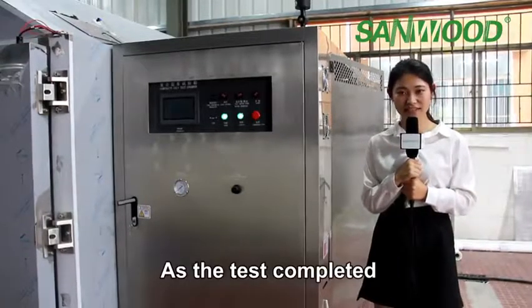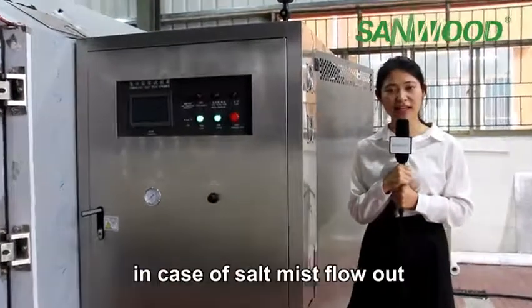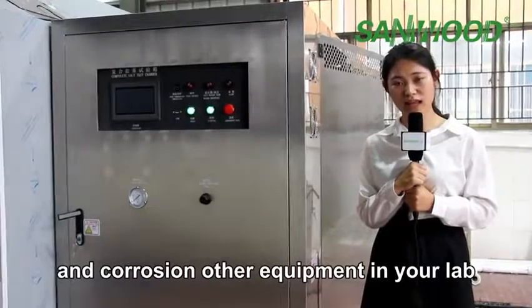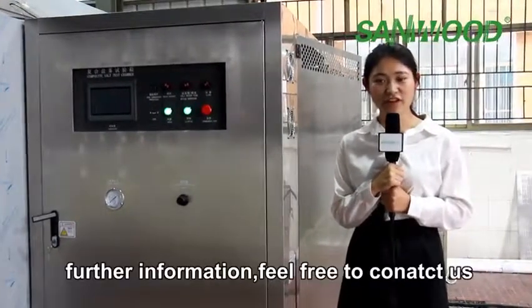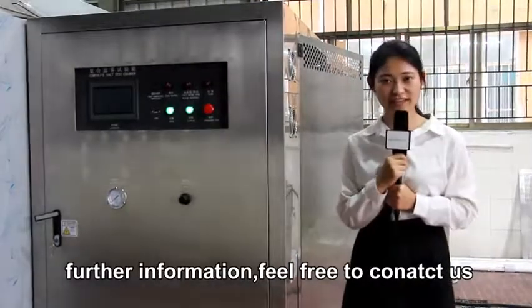As the test completes, open the door after the mist remaining in the chamber dissipates, in case any mist flows out and corrodes the equipment in your lab. If you have any questions or need further information regarding this chamber, feel free to contact us. Thank you.